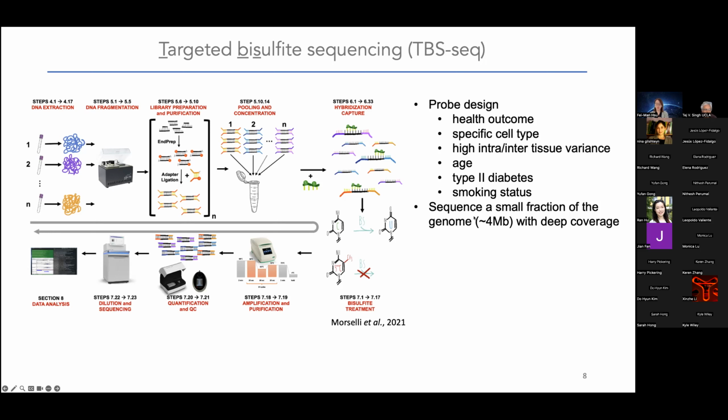With this method, we efficiently cut down all the sequencing amount we need for one individual. Remember, we have more than 100 clinical samples to sequence. If we wanted to sequence the whole human genome per person, there would be 3 GB multiplied by the coverage. So it would be way too much. So we use targeted bisulfite sequencing with the panel, which sequences 4 million bases per individual. And we can give every individual enough coverage to analyze this size of methylation.